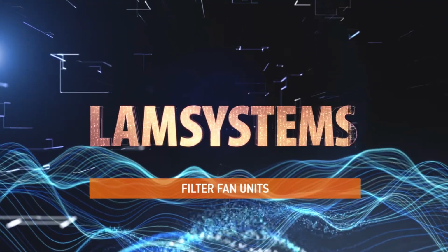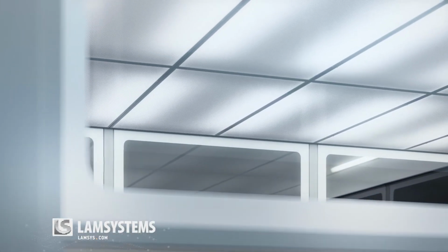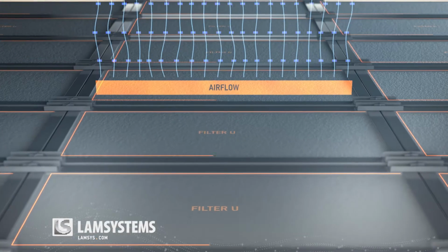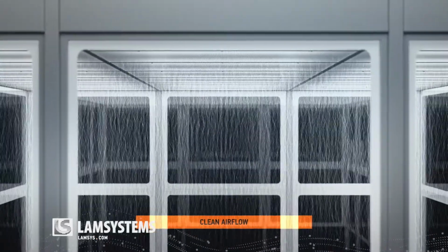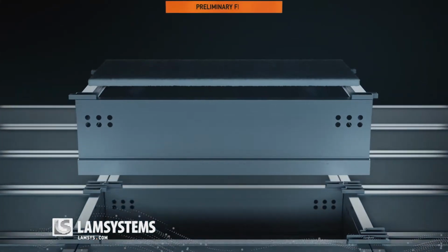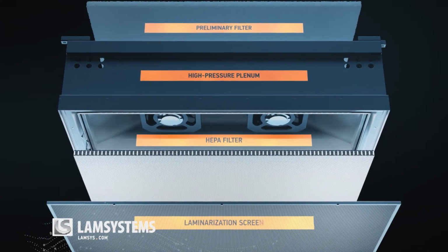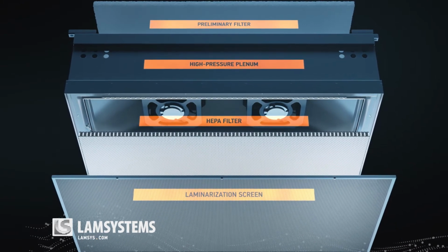Filter fan units. The main component of any clean zone is a filter fan unit, shortly FFU. Using forced recirculation through the HEPA filter, the filter fan unit cleans the air that is supplied into the work area. Structurally, the filter fan unit consists of supply preliminary filter, high-pressure chamber with centrifugal fans, HEPA filter, laminarization screen or turbulator, electronics module, filter testing system.